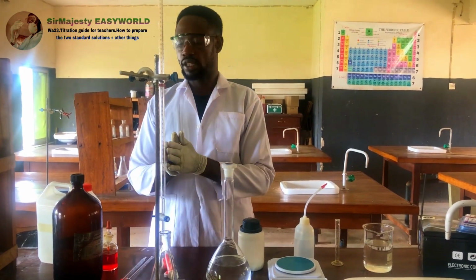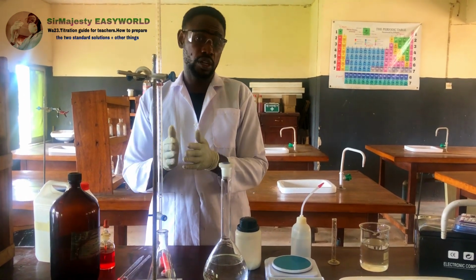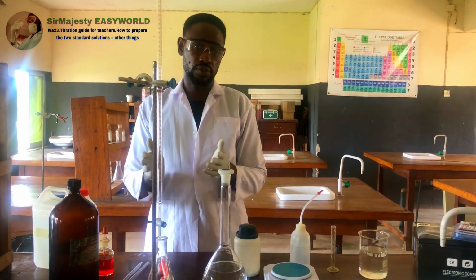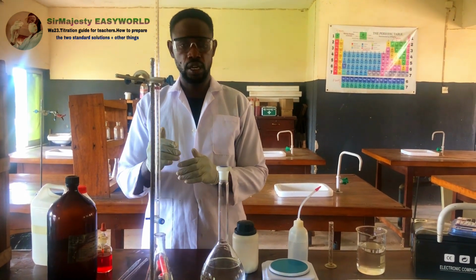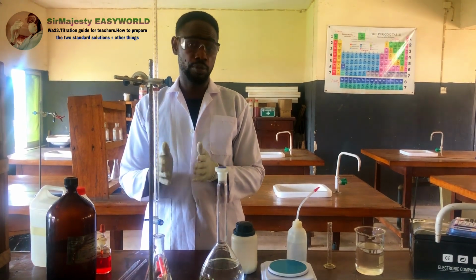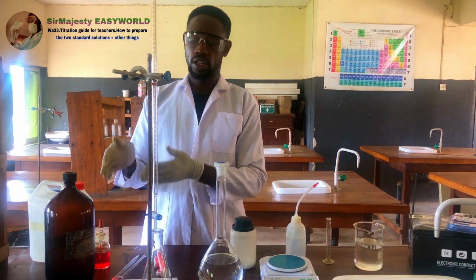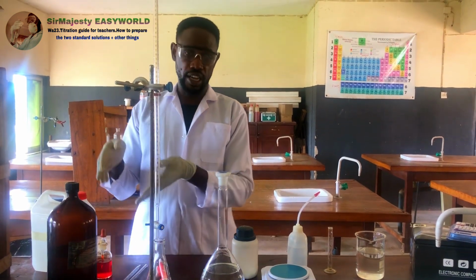The challenge here is that they just wrote 8.5 cm cube of HCl. They did not specify the percentage. And this gives chance for a larger range where the endpoints may be accepted, because this is not specified. Sometimes you might buy the one that has been diluted.